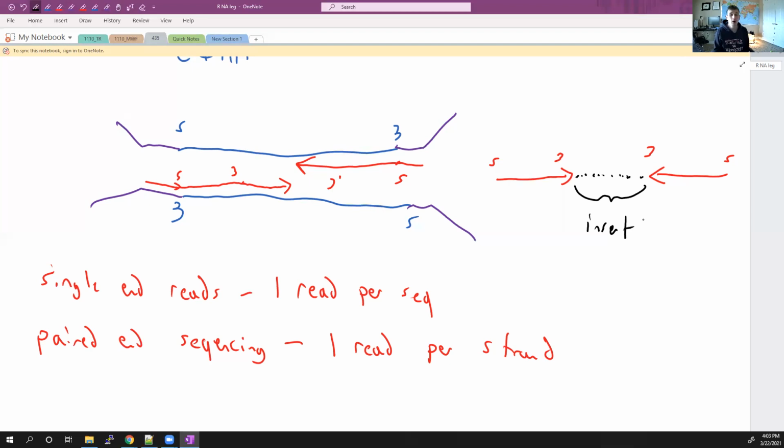And so whenever we do an RNA-seq, a lot of times there's going to be many, many fragments of an mRNA molecule that came from the same gene, but it just broke, and so these fragments will be of varying sizes. So even if we have a 1,500 or a 3,000 base pair mRNA, we can ultimately sequence the whole thing because it's going to fragment during this whole extraction process, et cetera.